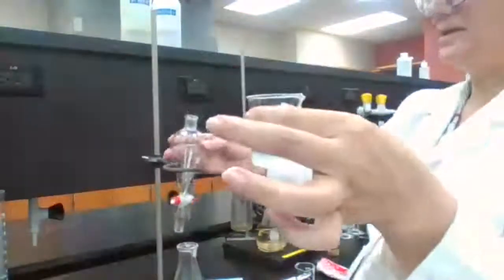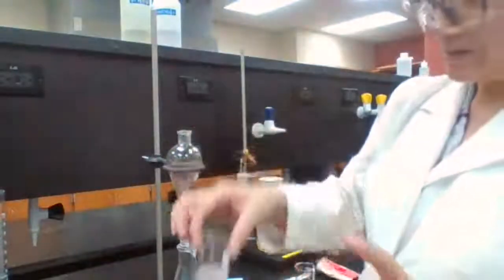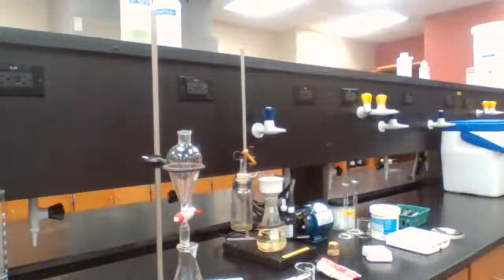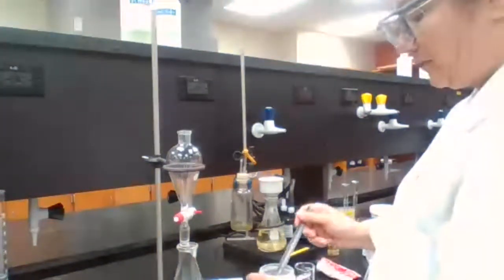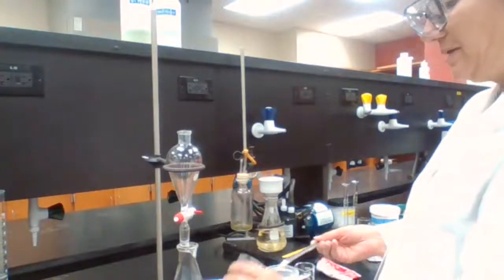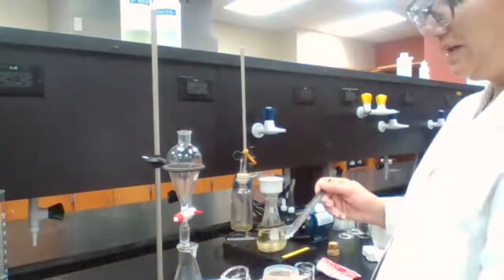It's not clear, it's cloudy. That means it's not completely dry. So we have to add the anhydrous agent. The anhydrous agent used for this experiment is potassium carbonate. So we're going to add the anhydrous agent.